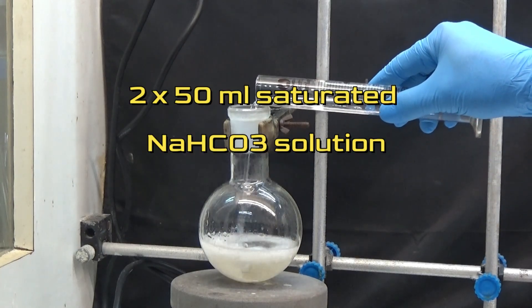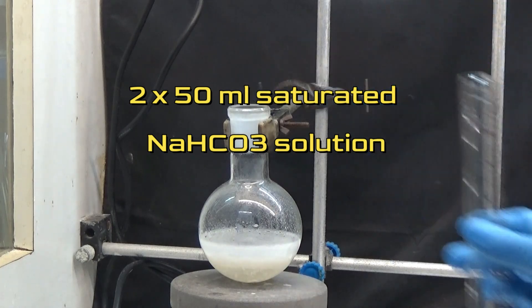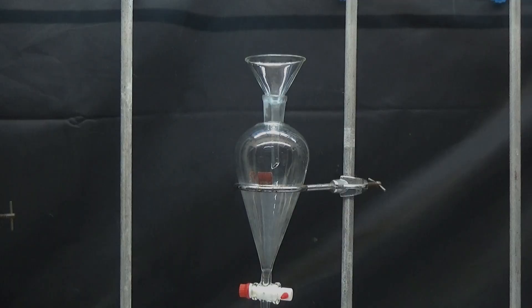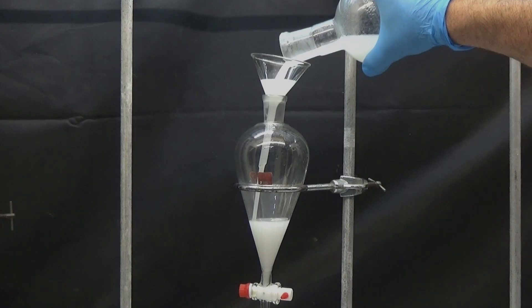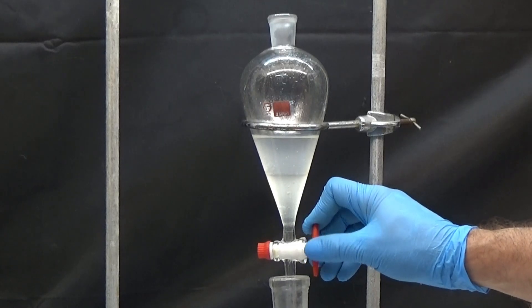After cooling, the remainder of the distillation is washed twice with 50ml of saturated sodium hydrogen carbonate solution. Separate the organic phase and the aqueous phase with a separating funnel. The aqueous phase is discarded.